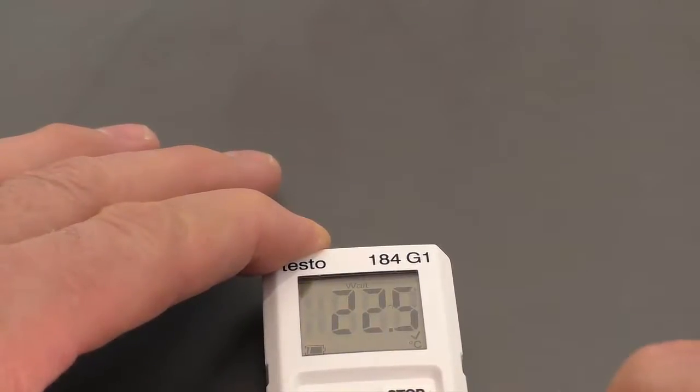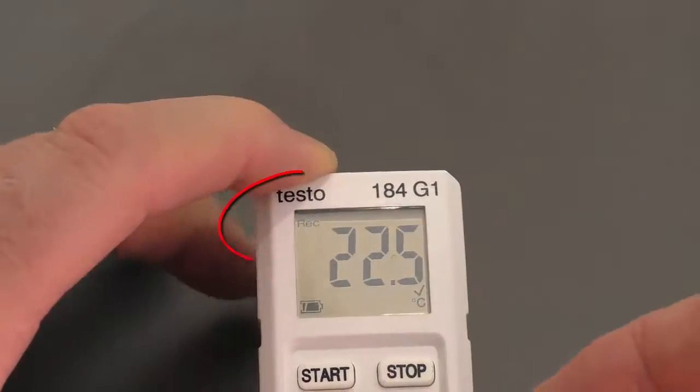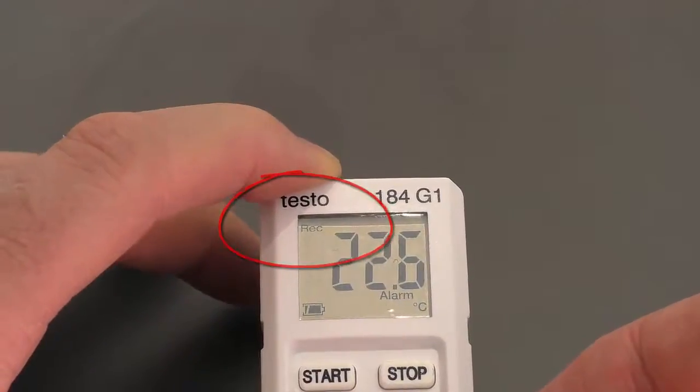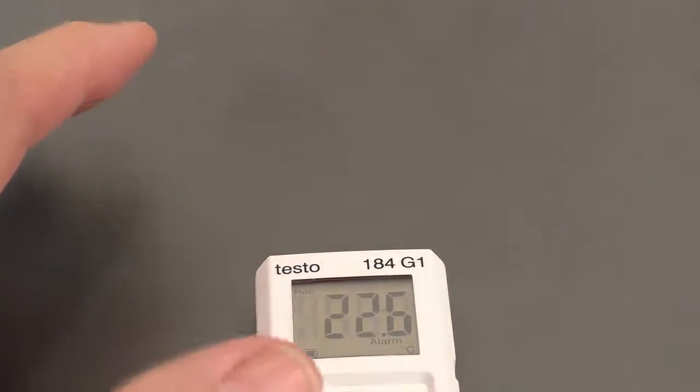We could have made it a time-based start and disabled the buttons. Now if I push and hold the start button for three seconds, we're now recording. So we're recording once a minute: temperature, humidity, and vibration. I'm going to leave it here and record a little bit of data.